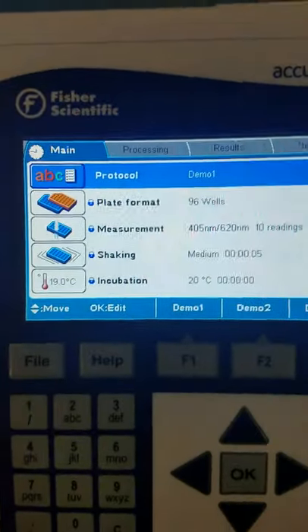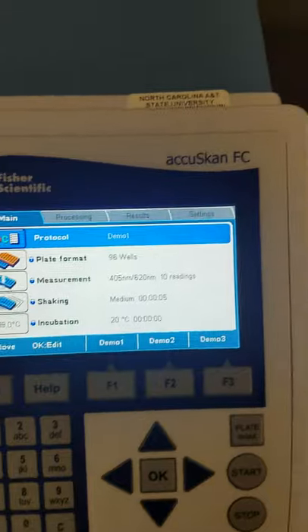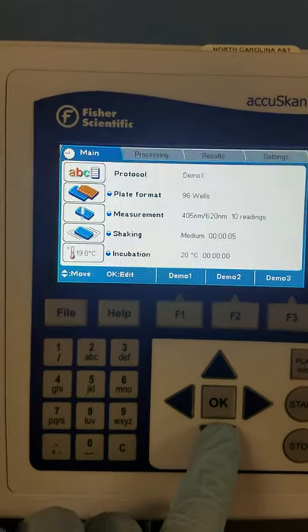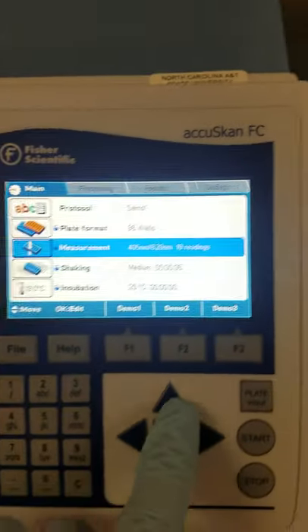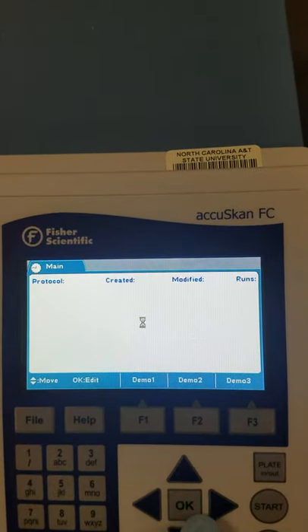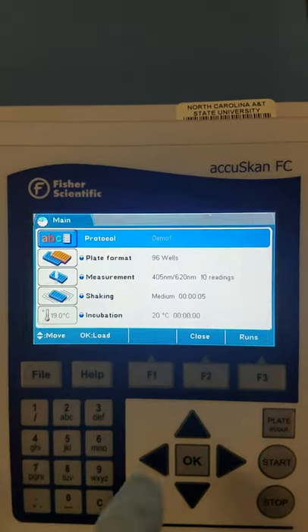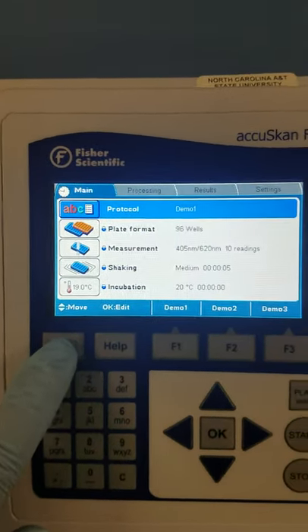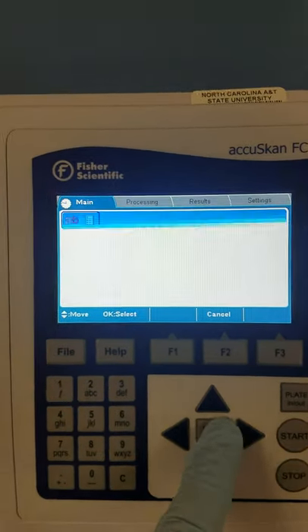Now we go to our screen. If you look at our screen, we can't really do anything — all these are locked because we are in a demo protocol. If you try to change the protocol, it just has preset protocols. So what you want to do in order to change these parameters is go to File > New.